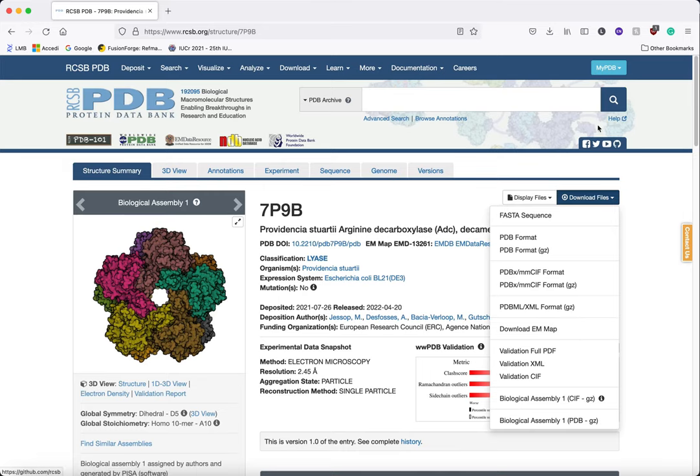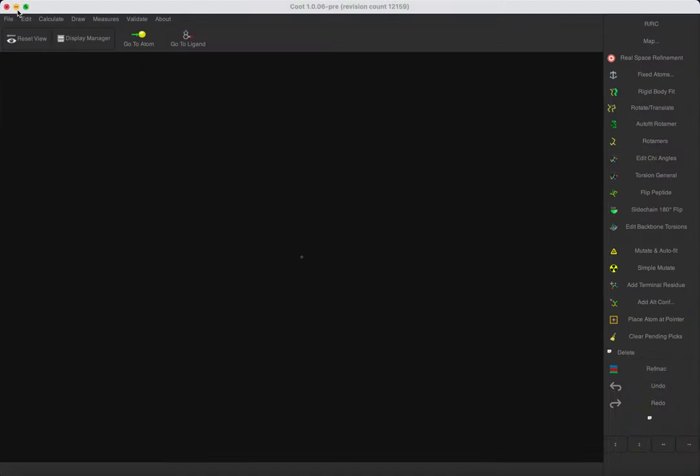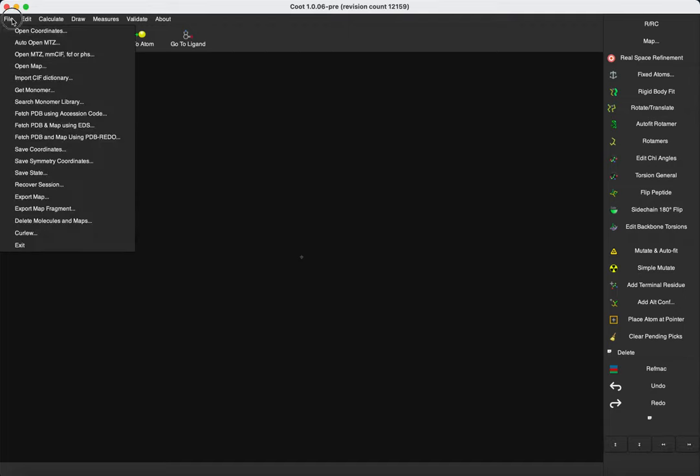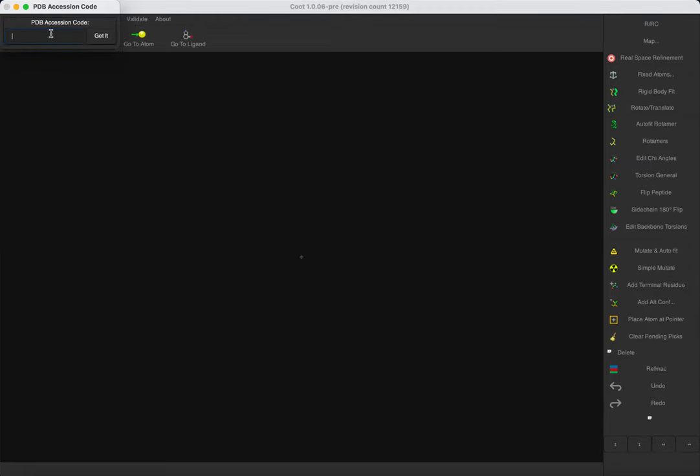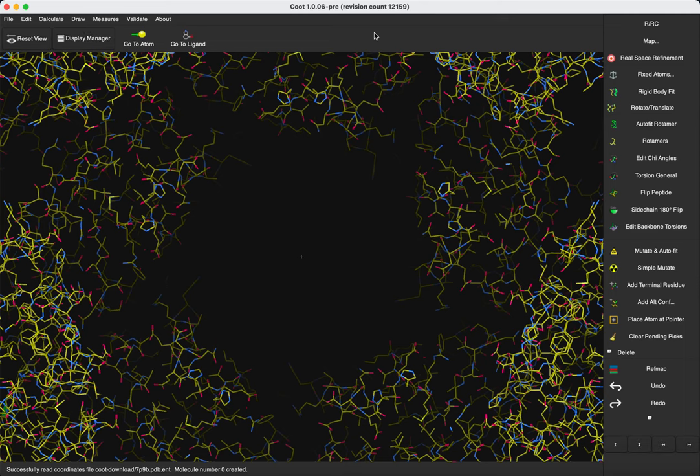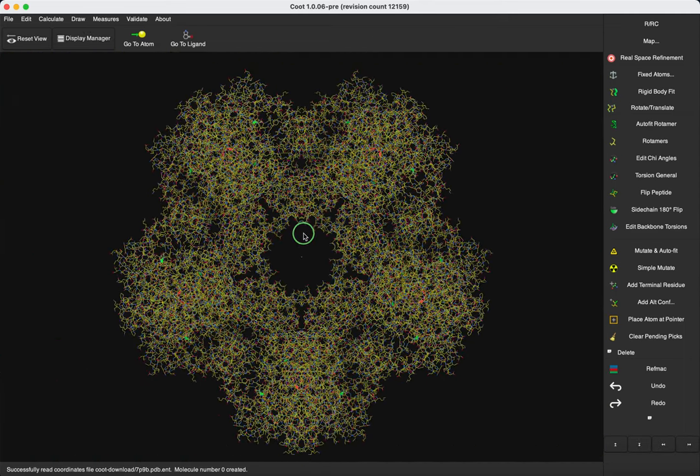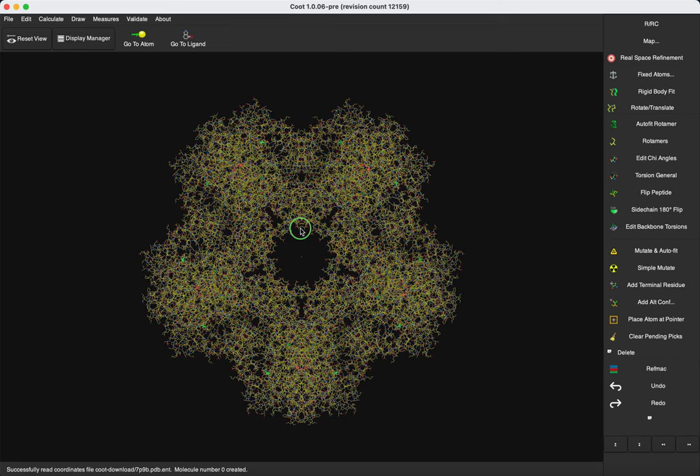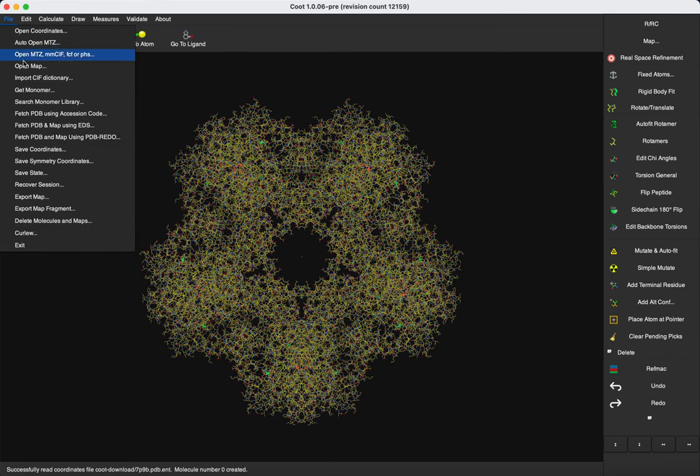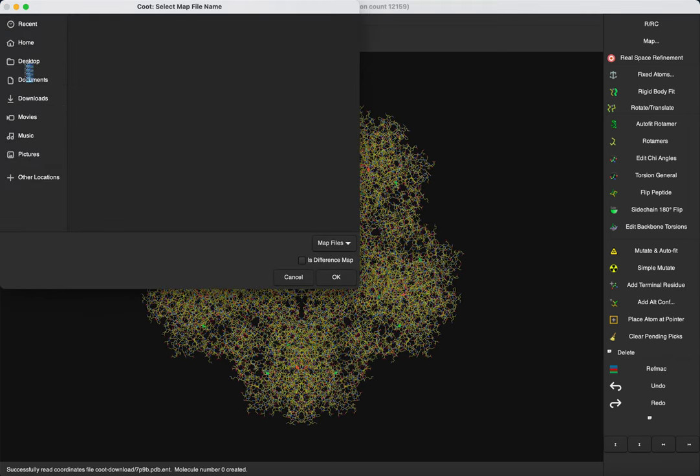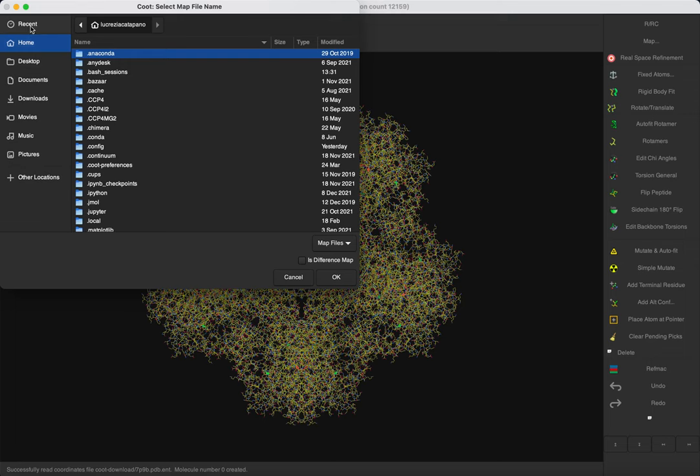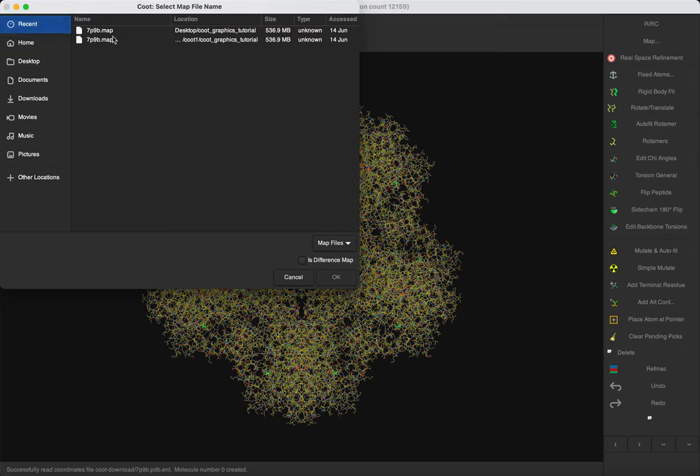So now let's open the Coot window. I already resized the window by using the Resize button, and let's fetch the model and open the map that we previously downloaded from PDB.